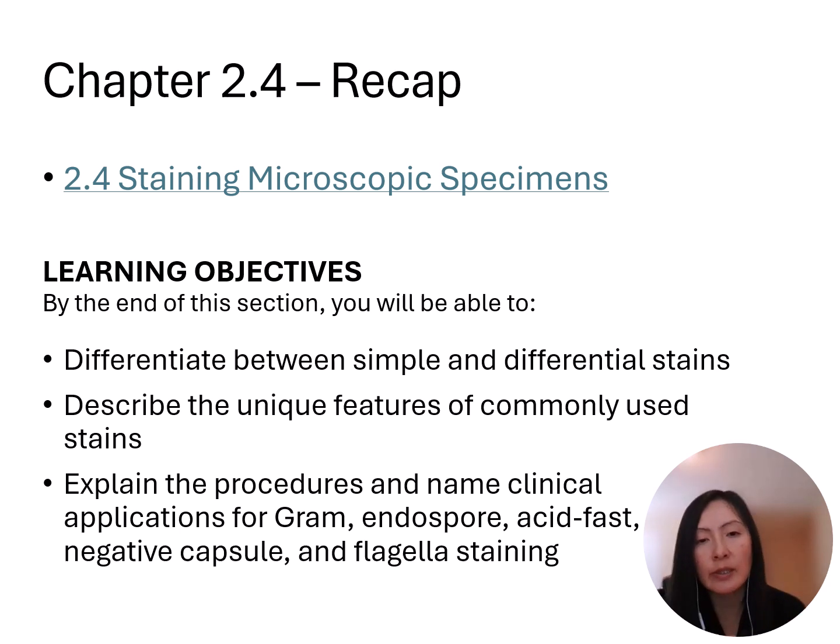Same thing for the last one, the procedures. So go through each of the staining procedures and make sure you can list the order of steps, what stains are involved, what color the cells appear after each step. So let's pretend we're going to do the acid-fast stain. First step, right, primary stain was carbolfuchsin, and both acid-fast positive and acid-fast negative cells will appear pink.